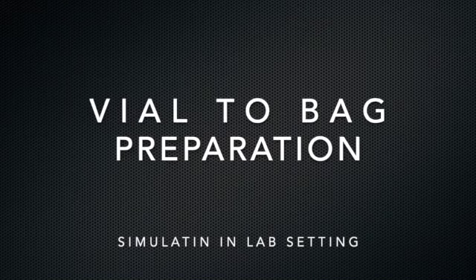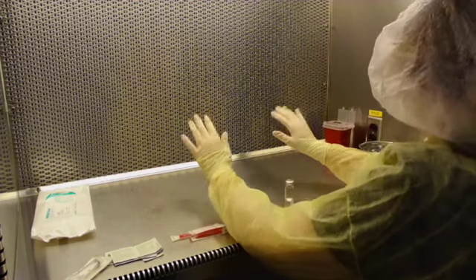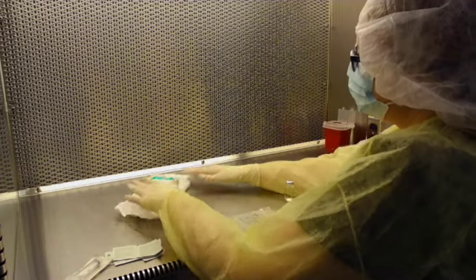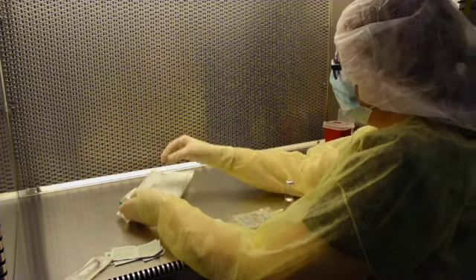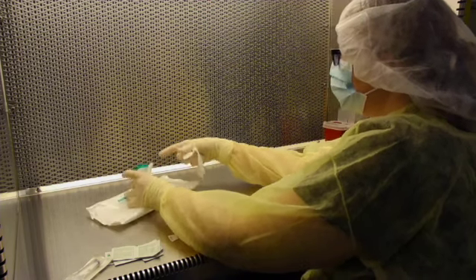Always clean your hands upon entry and re-entry into the PEC. Allow your hands to dry. The wipes must always remain in the first air from the HEPA filter. No, they are not sterile once they are open, but they must receive first air so we can ensure they are as clean as they can be.